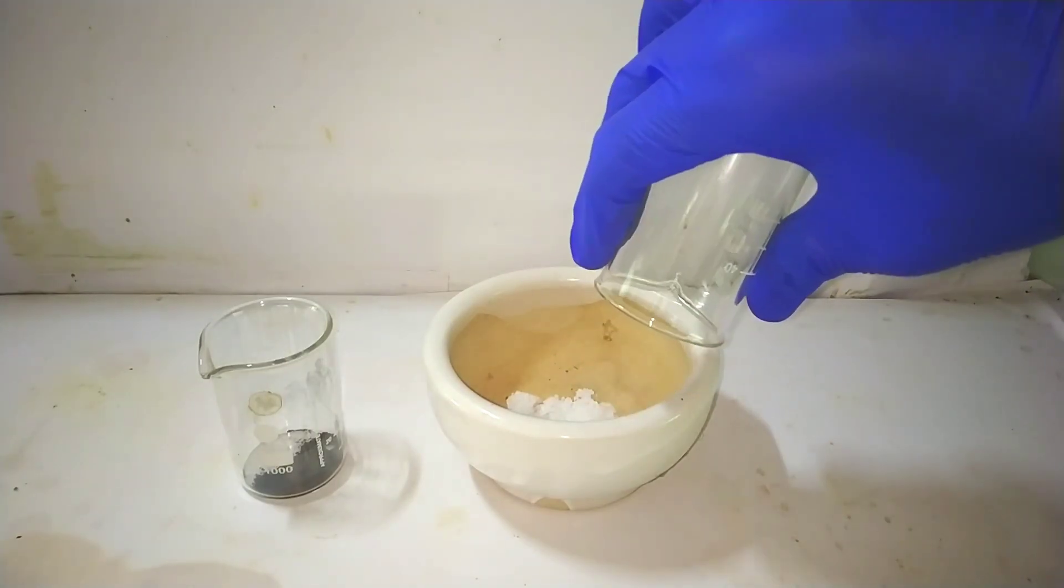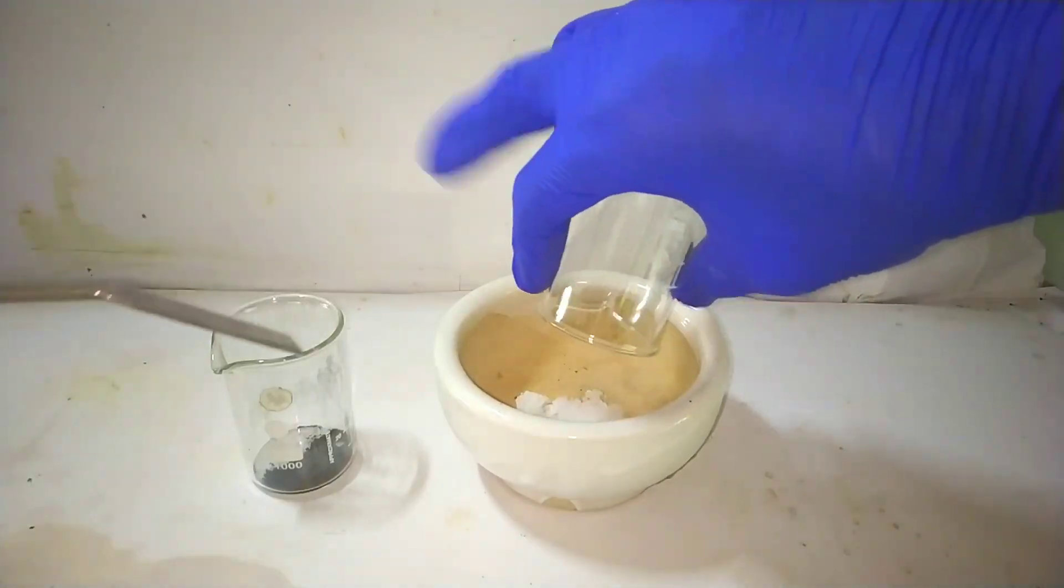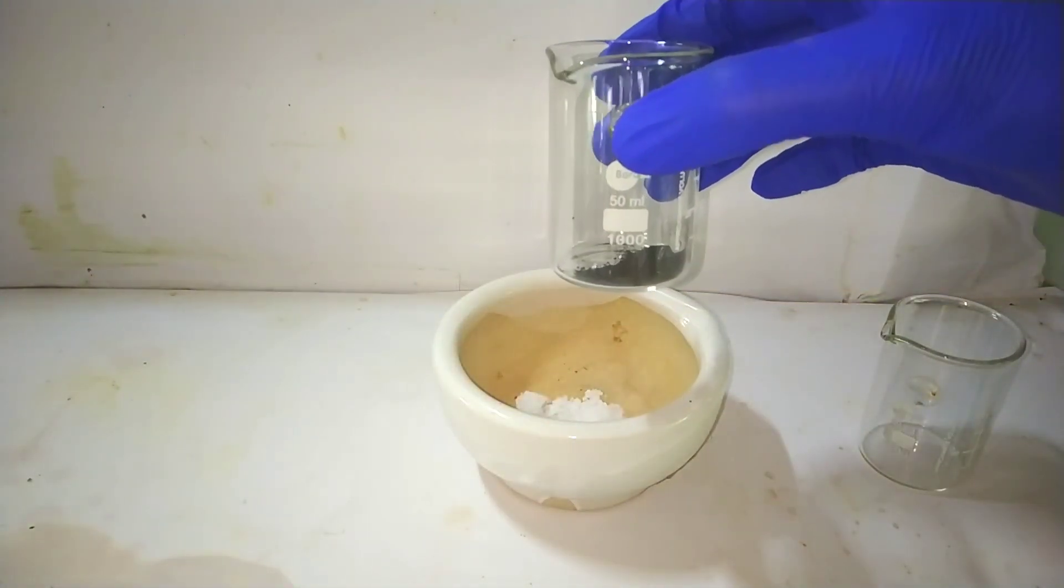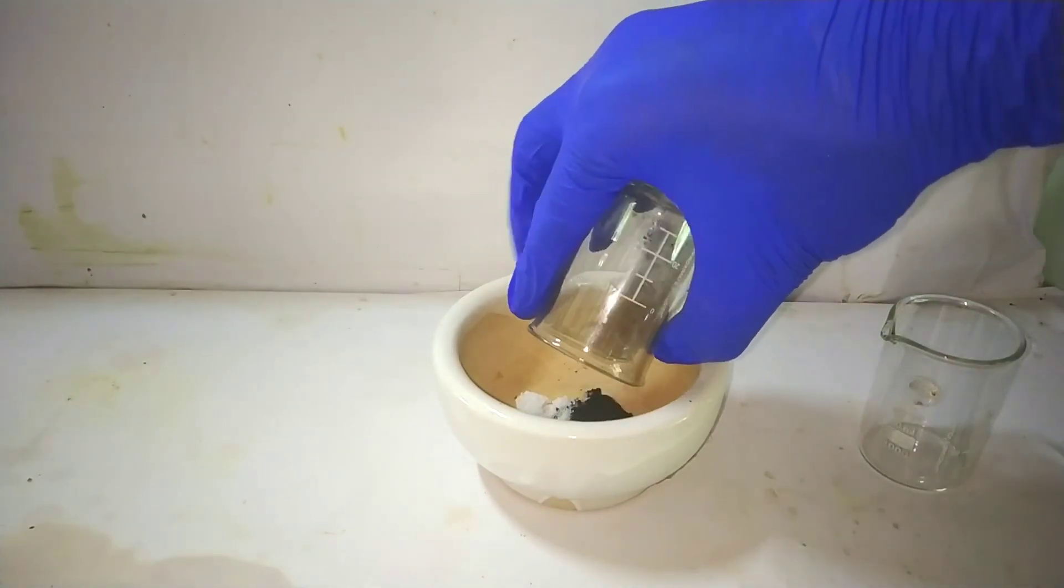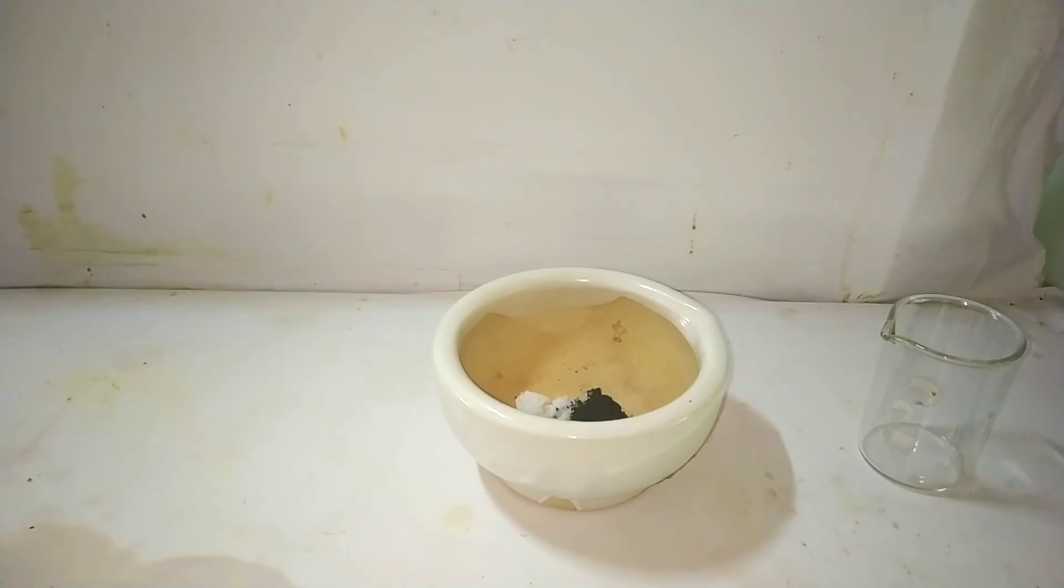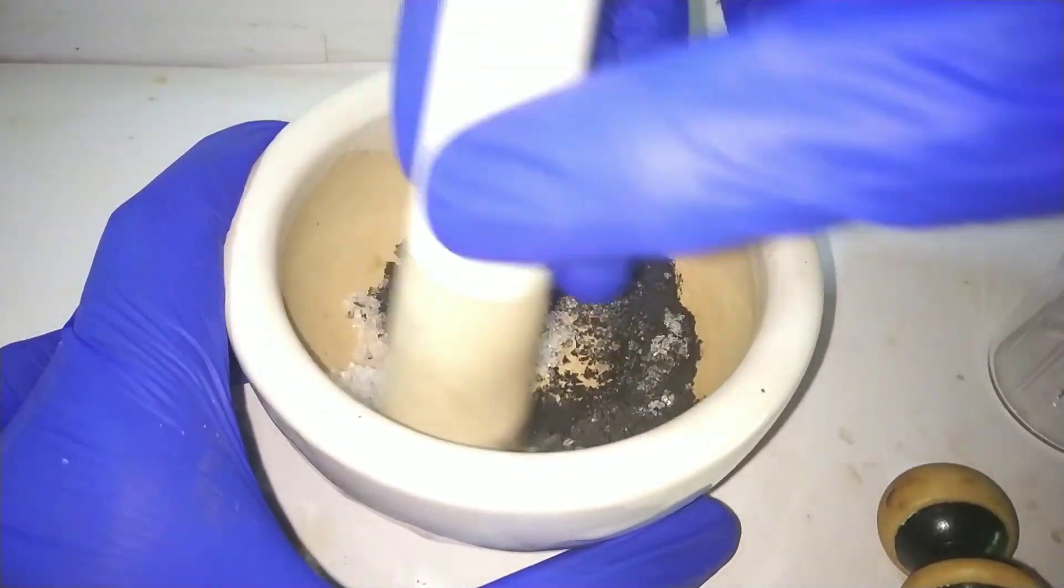We start by taking the pre-weighed 9.3 grams of ammonium dihydrogen orthophosphate and 2.3 grams of manganese dioxide together in a mortar. Ammonium dihydrogen phosphate was prepared by reacting ammonium carbonate with stoichiometric amounts of orthophosphoric acid, and manganese dioxide was extracted from batteries.